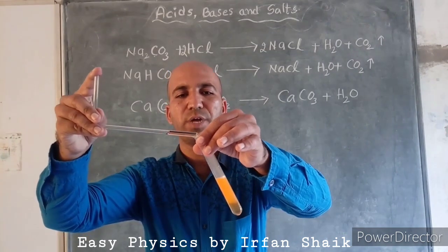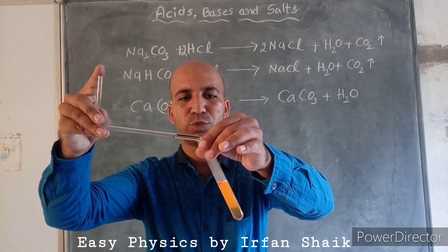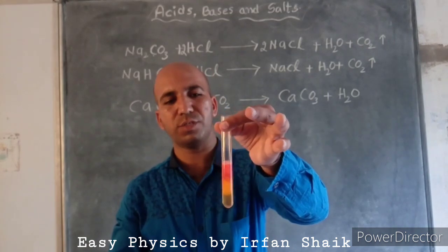So gradually we have to add a few drops of acid to this basic solution, and we have to observe the color variation in this test tube.